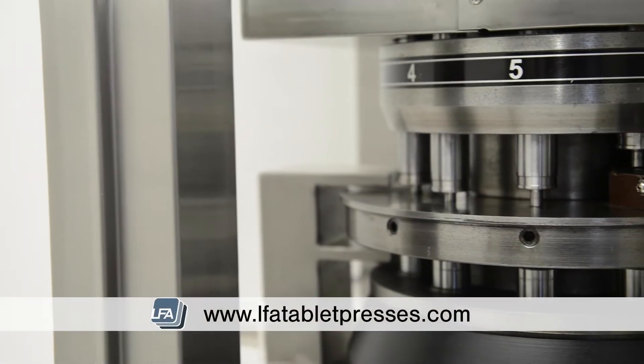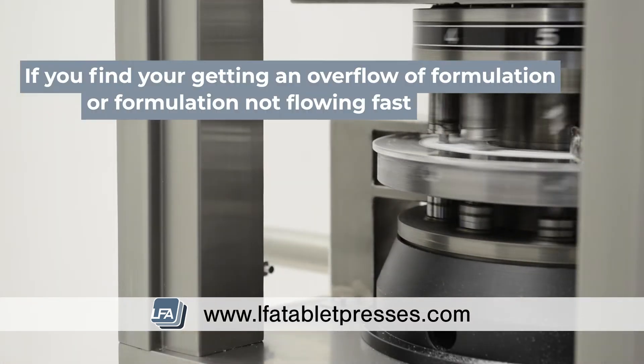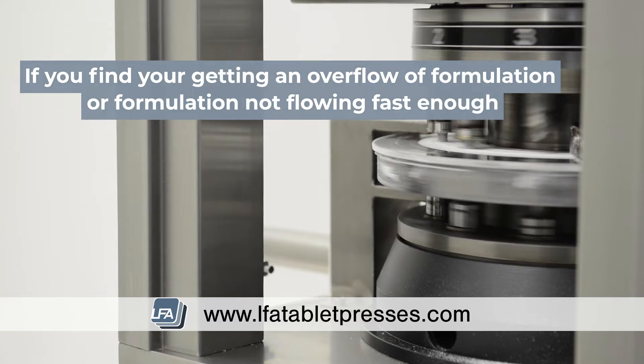Welcome to LFA's video on controlling your formulation's flow on your RTP-10i. If you find you're getting an overflow of formulation, or your formulation is not flowing fast enough, this can be controlled with a simple adjustment.